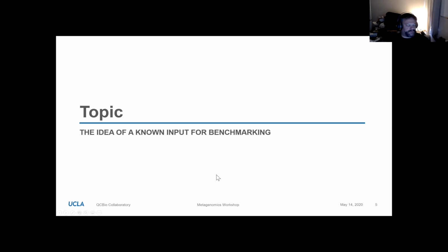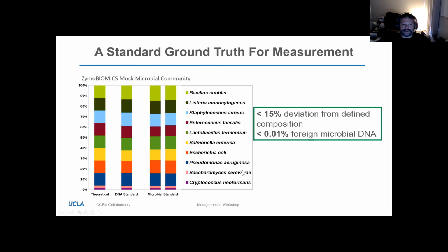So as I mentioned before, there's going to be one Zymo product that I mention. I generally try and avoid getting too much into brand names or specific products because obviously I have a little bit of a conflict of interest. But one of the things we worked on sequencing is the Zymo-Biomics mock microbial community. This is actually what it looks like.